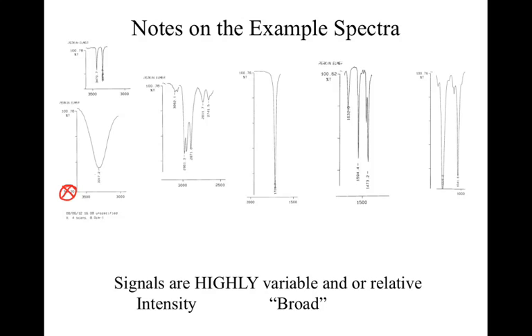The scale is all relative on the y-axis. The x-axis is not relative. Those are perfect. You can deal with those numbers. But the y-axis, ignore those numbers, which makes it more difficult with the version I gave you to interpret intensities. The intensities tend to be very relative to each other. Guys, that's what I'm trying to state at the bottom here.